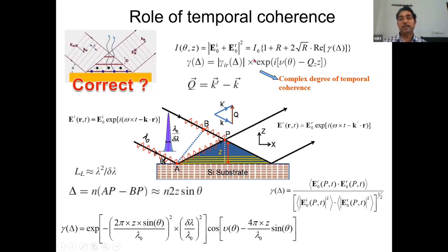So basically, this is the method. This is all the mathematics. If you want to determine the intensity as a function of theta at a particular height z, you have to just take the modulus of the vector sum, the vector addition. And then if you want the intensity, make it squared. If you detail it out, you can explain it in a more detailed way, and then you have this kind of expression.